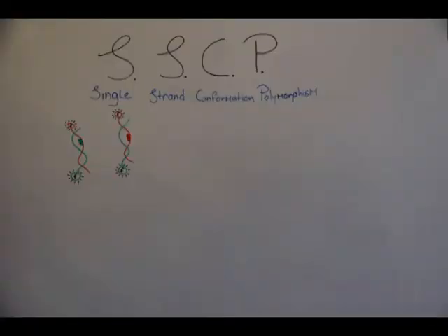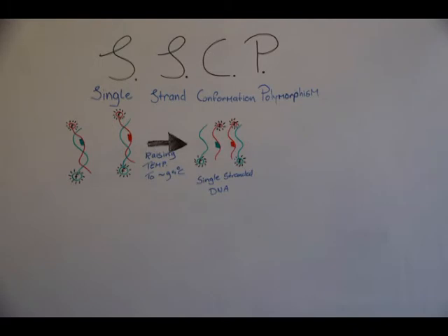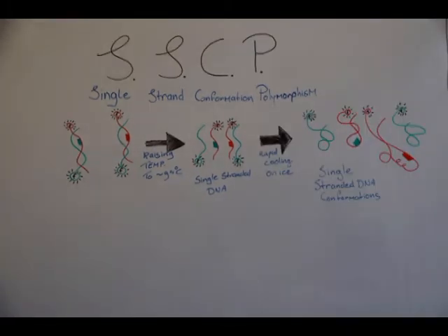The amplicons of the PCR will be denatured by heating. The single strands will be rapidly cooled to maximize self-annealing. Rapid cooling favors self-annealing because there is too little time for the strands to anneal to their complementary strand. By self-annealing, the strands will take on their unique conformation.